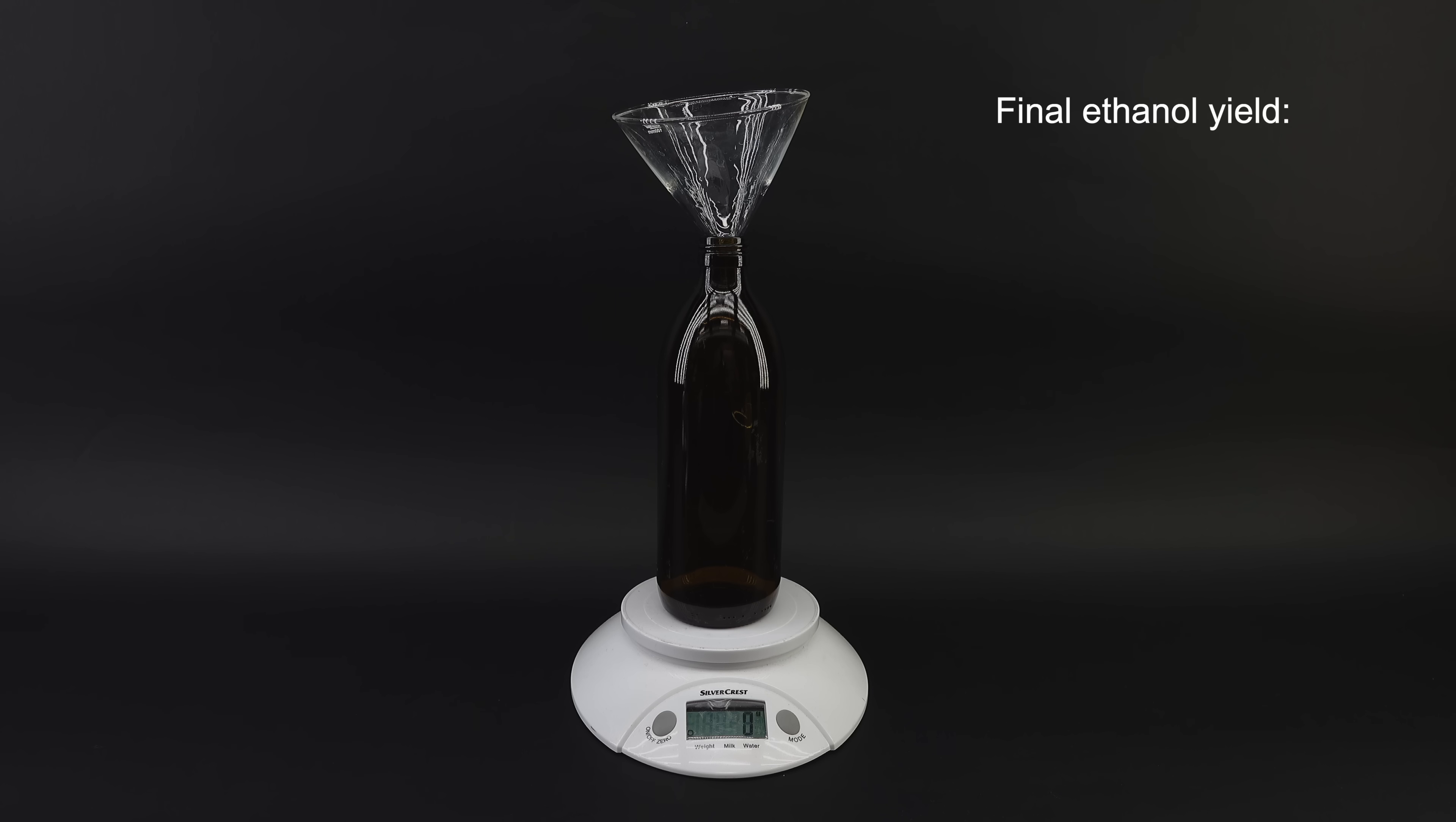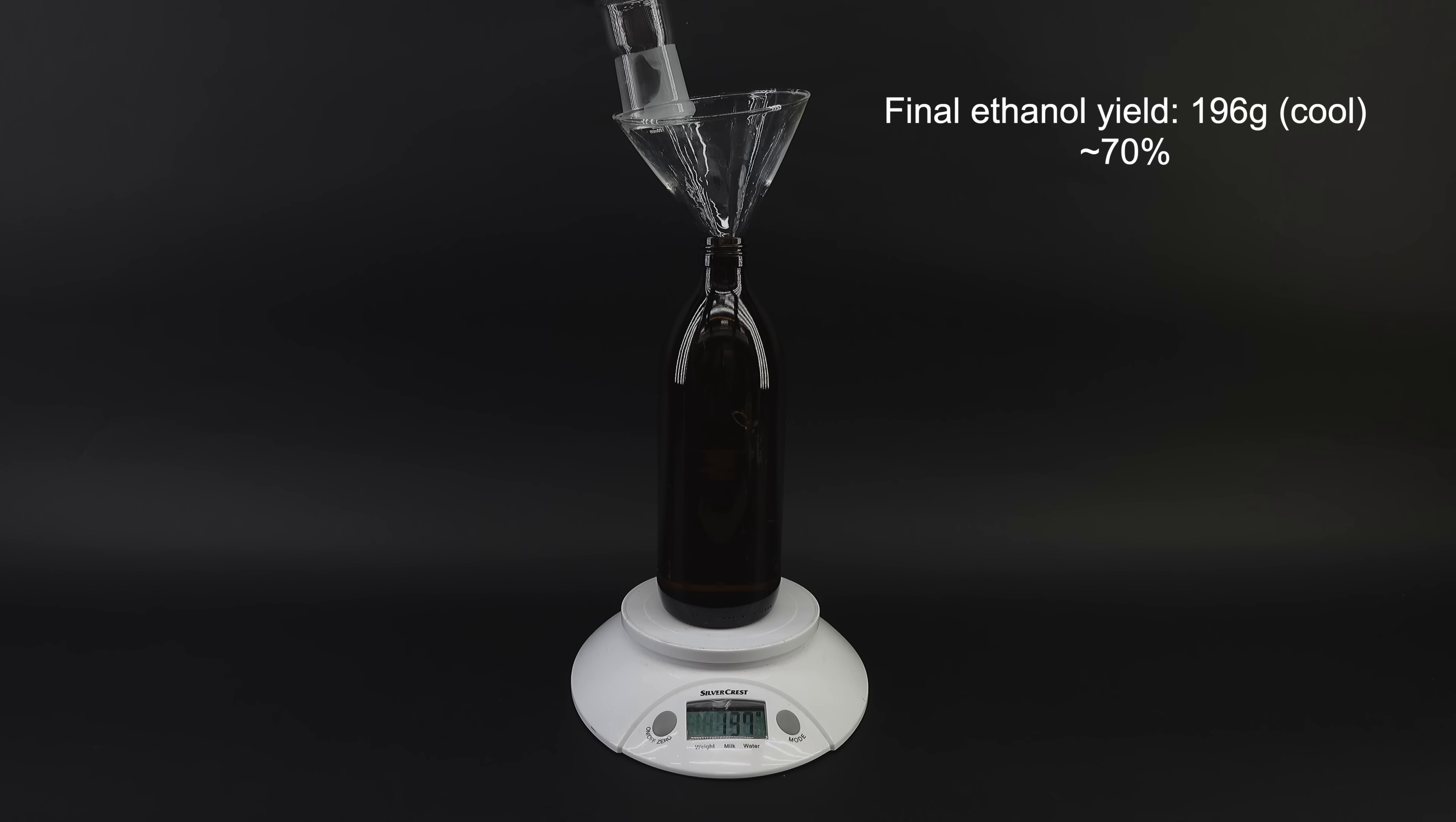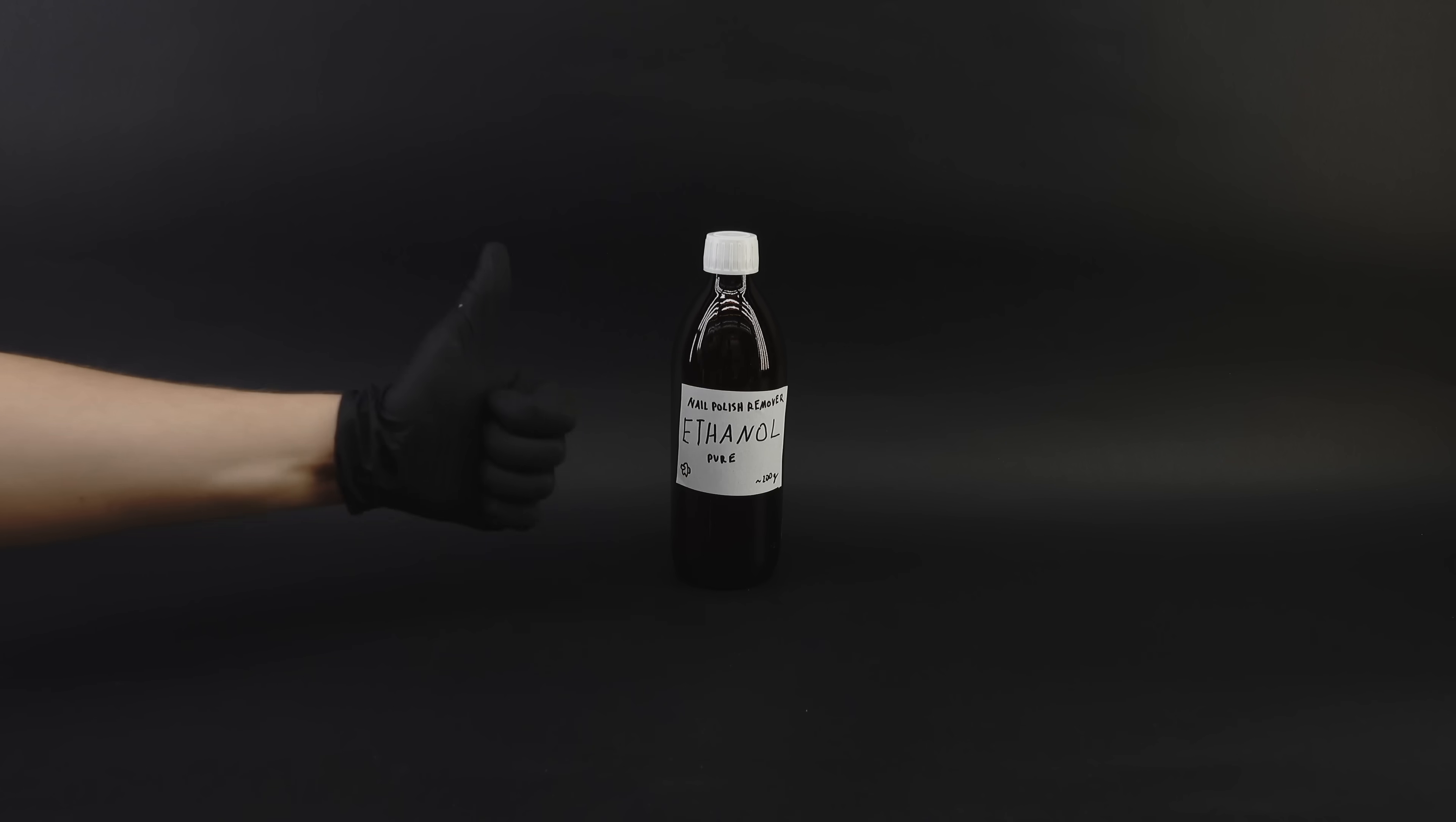Now, in terms of the yield from this whole grueling process, I managed to make 196 grams of pure ethanol, which corresponds to around 70% based on the roughly half a liter of ethyl acetate I used. This is kind of incredible, especially considering all the emotional roller coasters and distillations I went through, and it proves that combining nail polish remover and drain cleaner is a real way of making alcohol.